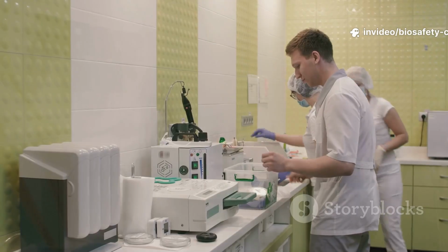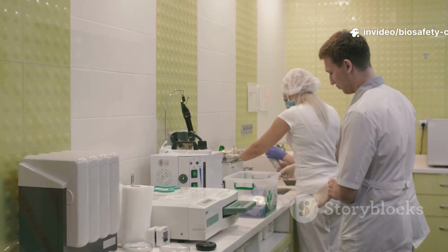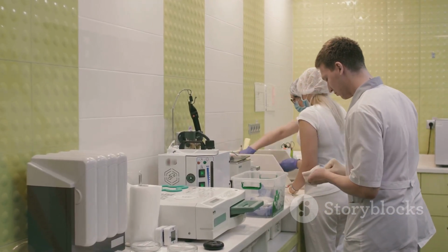So, quick recap: Class 1 protects you and the lab. Class 2 protects you, your samples, and your lab, with 4 subclasses for different needs. Class 3 is total containment for the most hazardous work.